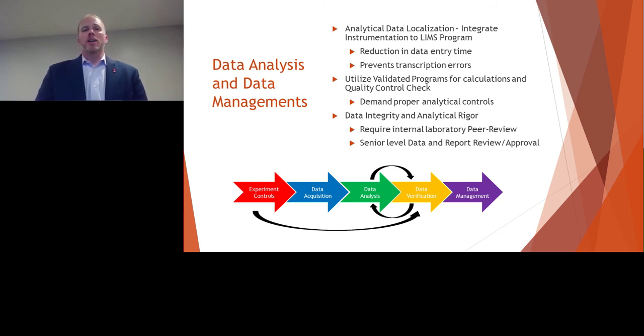I know some states require that the laboratory director is the final check. Some require just a senior-level analyst. So you have to understand what the needs for your particular program are, and also how long data has to be maintained and what condition that data has to be in, whether digital is appropriate, or whether there needs to be any type of hard copy produced.